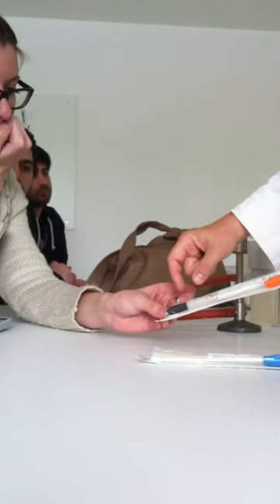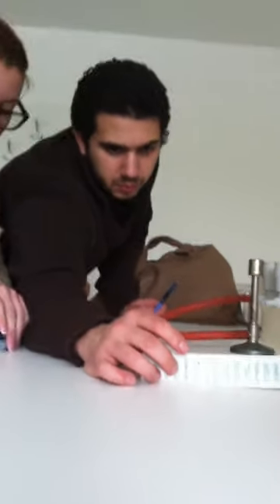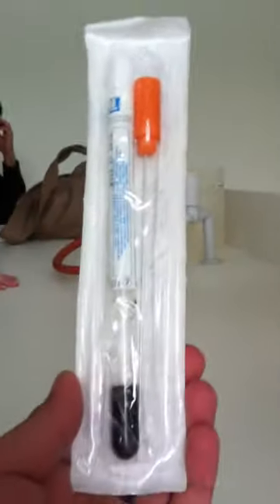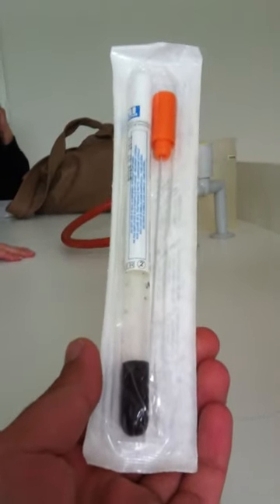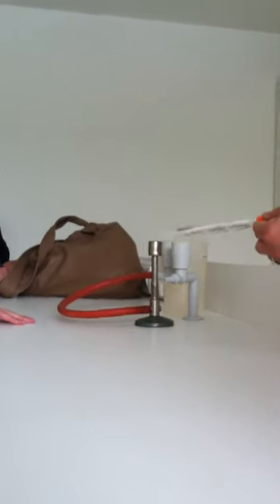And why? You can see the carbon, specific carbon in the transport medium. Sometimes the bacteria are so fastidious, such as Streptococcus pneumoniae, Haemophilus influenzae, Neisseria gonorrhoeae. If the transport medium contains carbon, then it's more suitable for fastidious bacteria. Neisseria meningitidis is from CSF, Neisseria gonorrhoeae from the urethral swab, or Streptococcus pneumoniae, for example from a nose swab, Haemophilus from here.